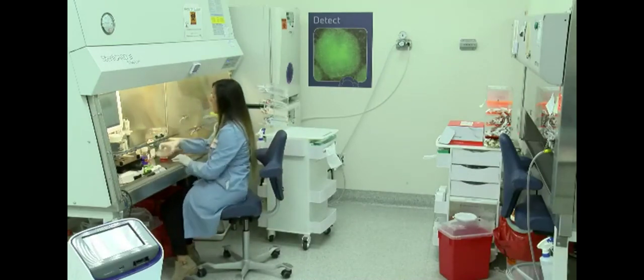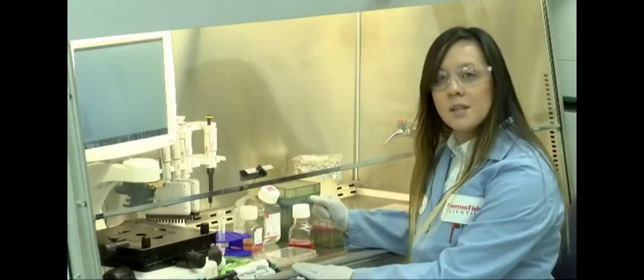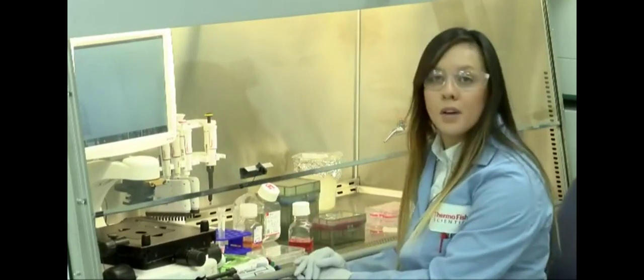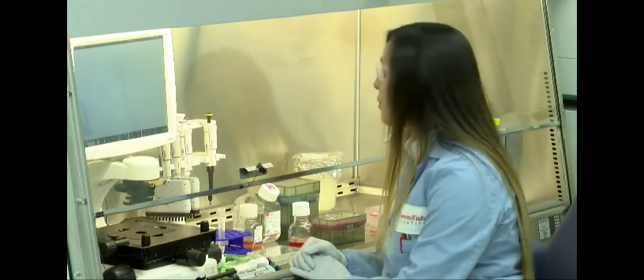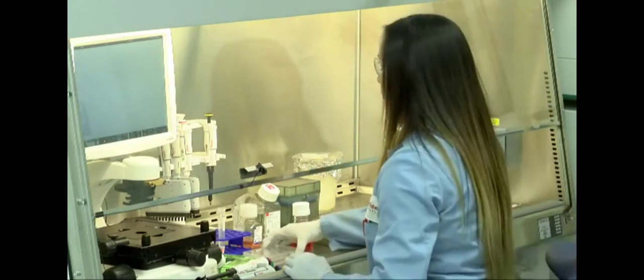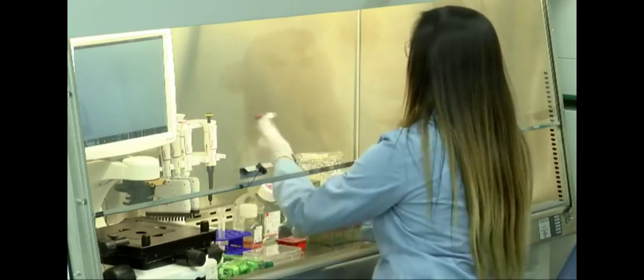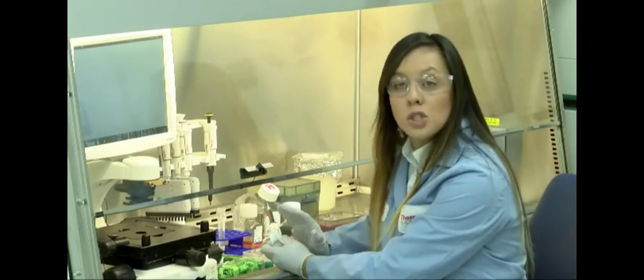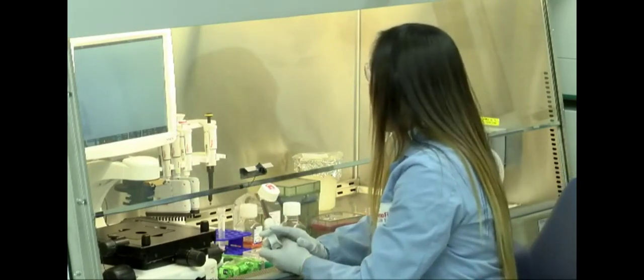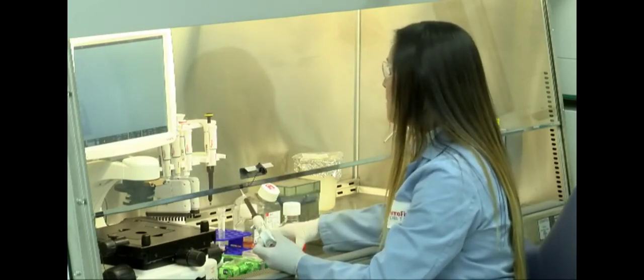So I have an already coated poly-D-lysine and double-coated mouse laminin plate. So that's 50 micrograms per milliliter of poly-D-lysine, and then 3 micrograms per mil of mouse laminin. So you're going to double coat those, and then once I have my double coating, I'm going to count the appropriate amount of cells. So for B27 and Culture One supplement, we recommend about 4 times 10 to the 4 per centimeter squared.